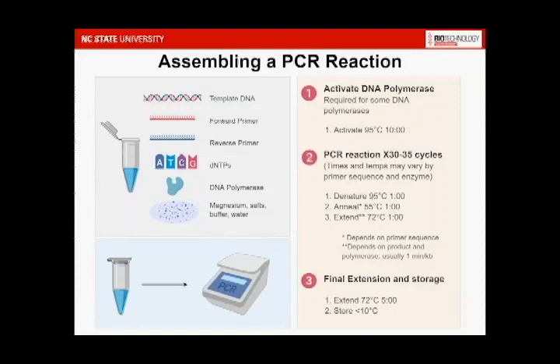The denaturation step is carried out at 95 degrees, and 1 minute is sufficient for complete denaturation. An annealing temperature of 55 degrees is 5 degrees below the melting temperature of an ideal primer. This may need to vary if the primer melting temperature deviates from the 60-degree optimal temp. However, lowering the annealing temperature too far below the melting temp can lead to multiple PCR products, because the primers will be able to anneal to less than perfect complementary sites.